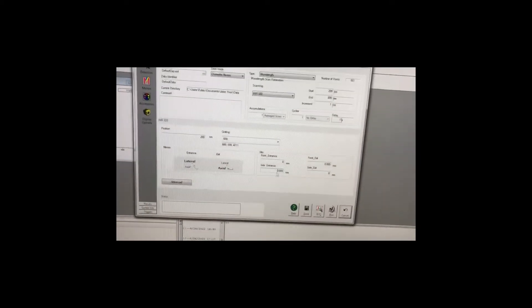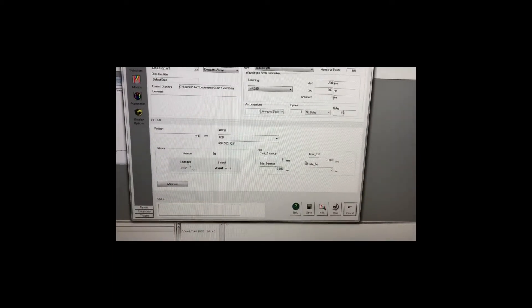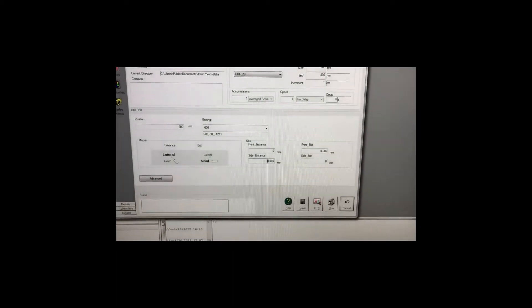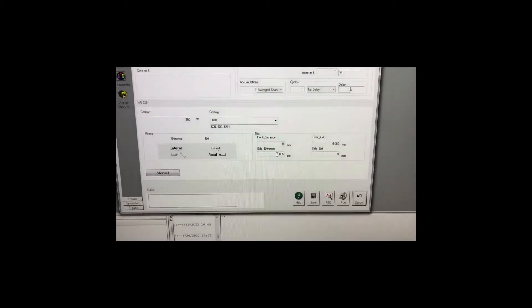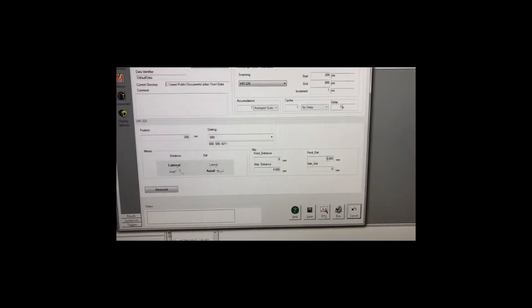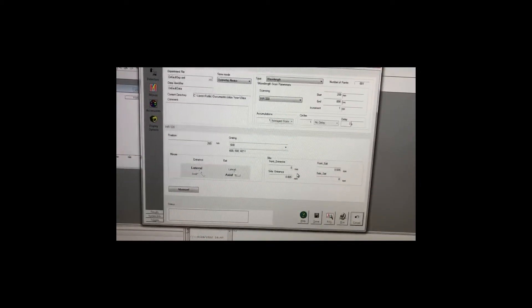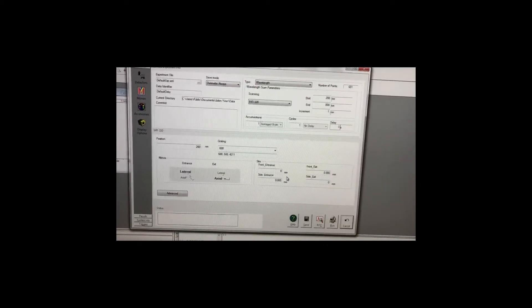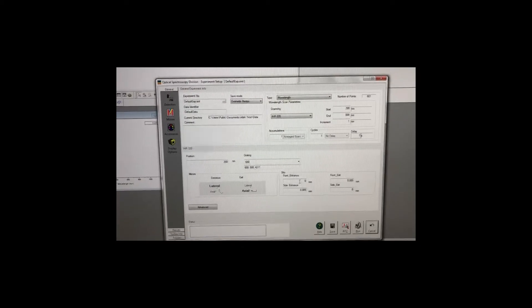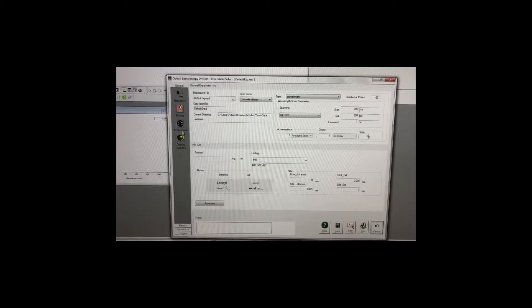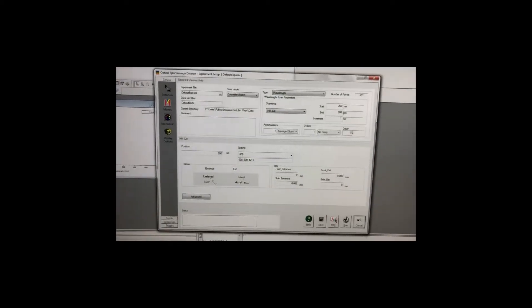Make sure that the slit, the front exit entrance and also the side entrance is based on what material you are using. If we are using InGaN, the size is 0.005 as mentioned in the step by step to perform optical measurement. Now you click monos and then you will click run.